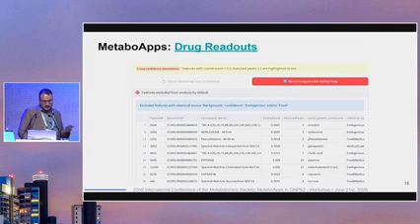As I said, you can download each of those tables when you scroll above them. The app is going to show you the option to download those tables.